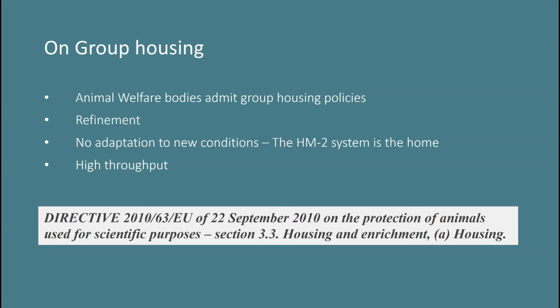The actual number of animals per cage varies with strain, legislation, and also experience of each country, state, and facility, and even the technician. So it's tough to give an overall general estimation, as it's very country and site specific. But I will say that our typical experience with mice, for example, the male C57 Black 6, is 4 per cage, because these can be rough on each other. Females are often housed by 8 or even more individuals.